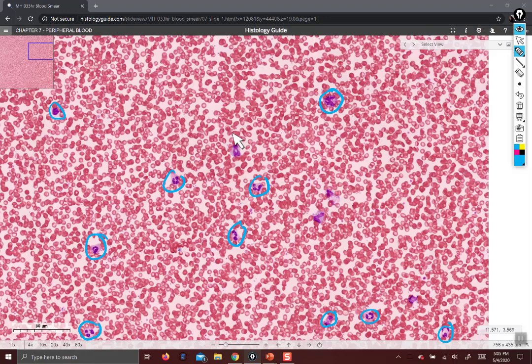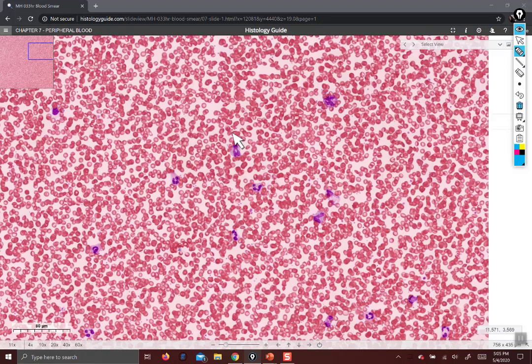Once you are practiced enough, you'll be able to identify all types of blood cells with ease. But it's just a matter of practice — you've got to spend time with the slides. So let's move on to vessels.